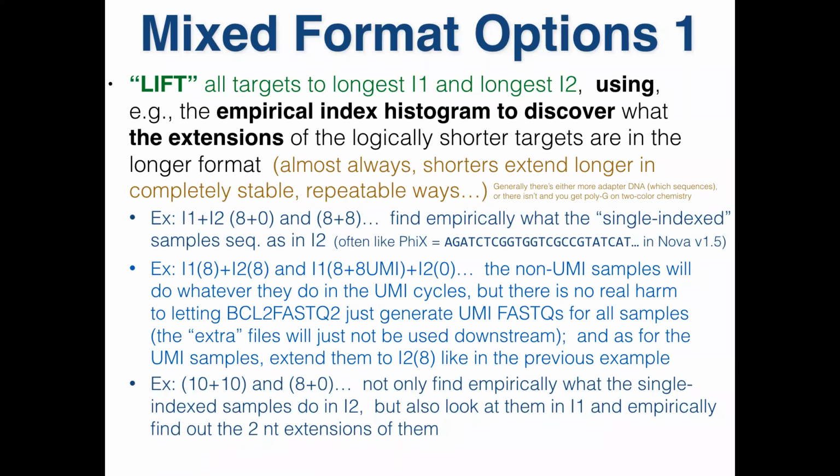The slightly more complicated case is what happens if the samples with UMI bases have those UMI bases on cycles that the other samples want to use for demux. That's a little tricky. In particular, that can be tricky because now UMI bases are random, and they can, with some frequency, match anything. So now there are some cases where you can argue about the distribution of values in the UMI and a particular person, that the chance of confusion is low, so the mismatch chance is low. I generally prefer not to have to think about that and worry about that too much.